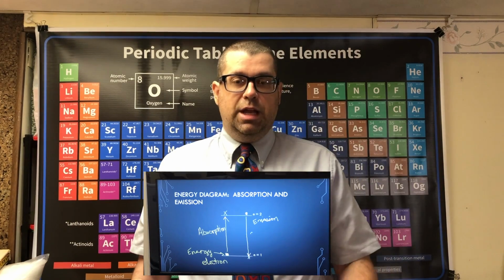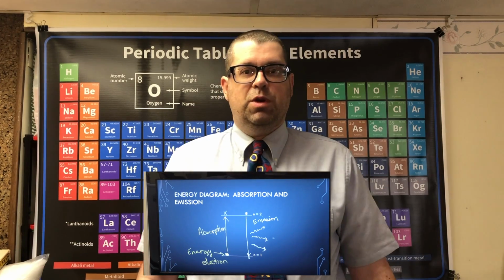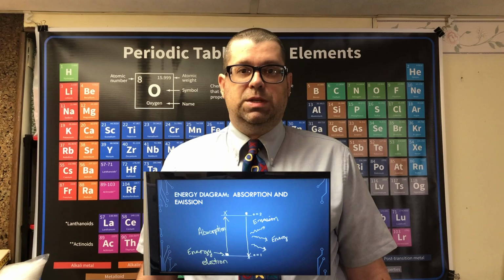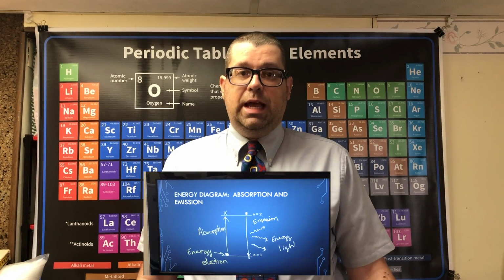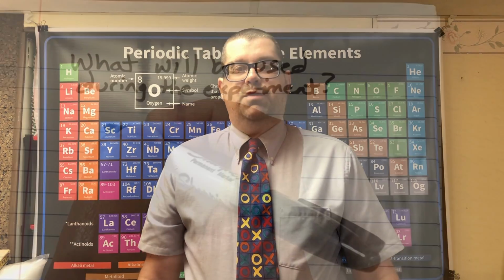Now that's the phenomenon we do see. So whenever you see light, you see colors, you see both, you feel heat, warmth, whatever, that is from the emission process. He also found that this happens uniquely with different elements. So what we're going to do today is demonstrate this with several element metal solutions, and you're going to see this phenomenon in action and see what happens when you energize different metal solutions with a Bunsen burner, thus creating what are called the flame tests. So as you watch the video, follow along using the lab handout that your teacher has provided you.